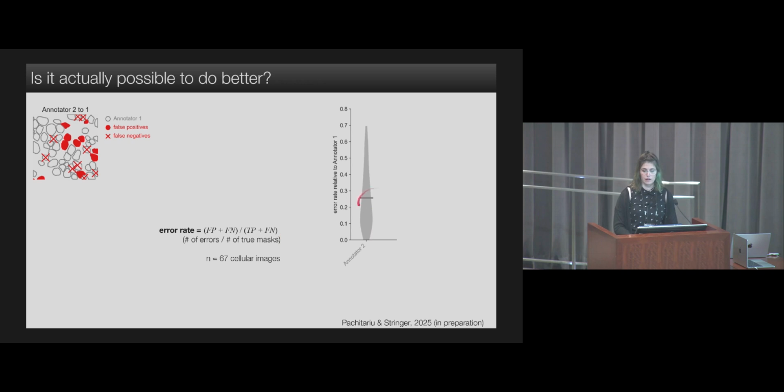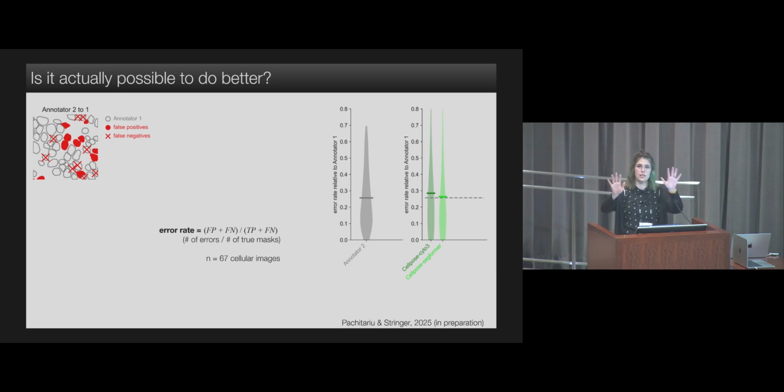And we can get what some might call a lower bound for the error rate we can get for segmentation. If we compare that to our Cellpose models, the Cyto3 and the segformer model, we see we're pretty close to this supposed lower bound. But we don't actually think this is the true lower bound because if you think about it, each annotator 1 and 2 will randomly make some mistakes, let's say 10% of the time. And then you're comparing these two noisy estimates to each other.